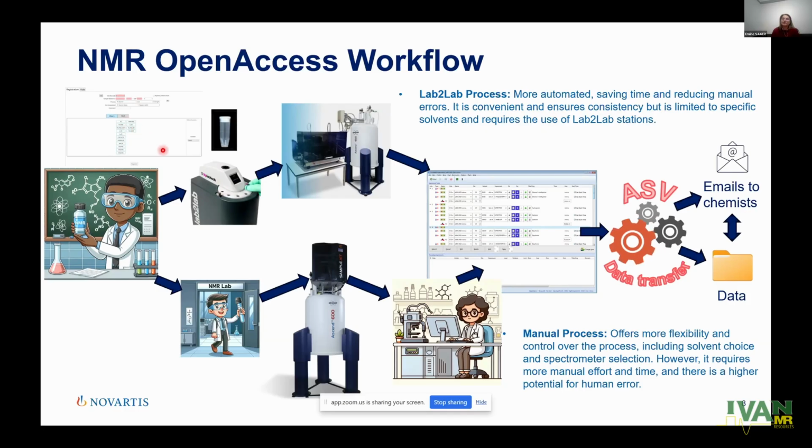Here it is important that he chooses only one set of experiment, because if you choose 2, you can imagine, in one vial we only have enough quantity for 1 tube, and we decided in this case to block the vial in the buffer, so that we are sure that it will not go to the lab-to-lab NMR, and the empty vial in this case goes to a second one. You can imagine the tube is empty, so it's not possible to fill a tube and to measure something. Then the robot will work alone.